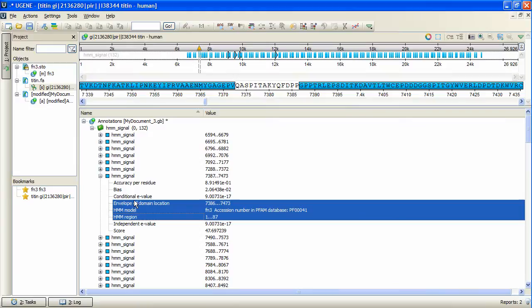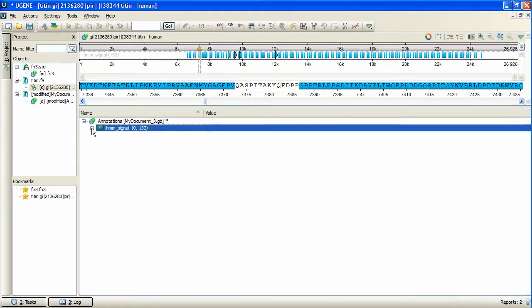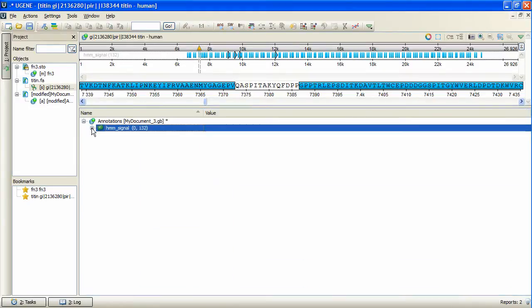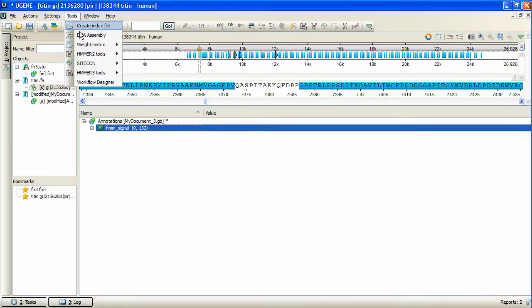Yet another operation that can be done with Ugene HMMER3 plugin, besides building a profile HMM or searching HMM signals with a profile HMM, is searching a sequence against the sequence database.